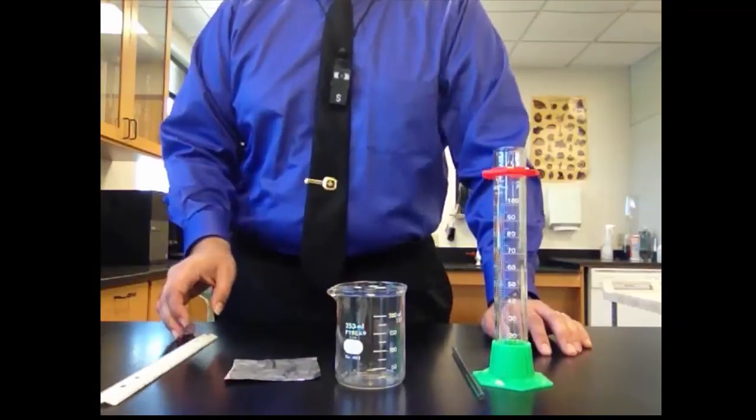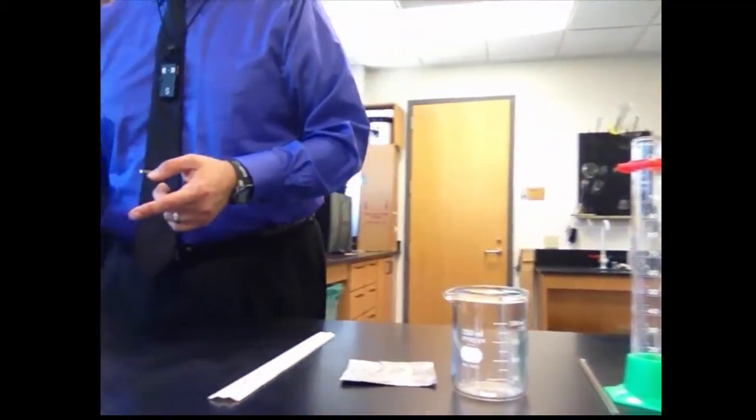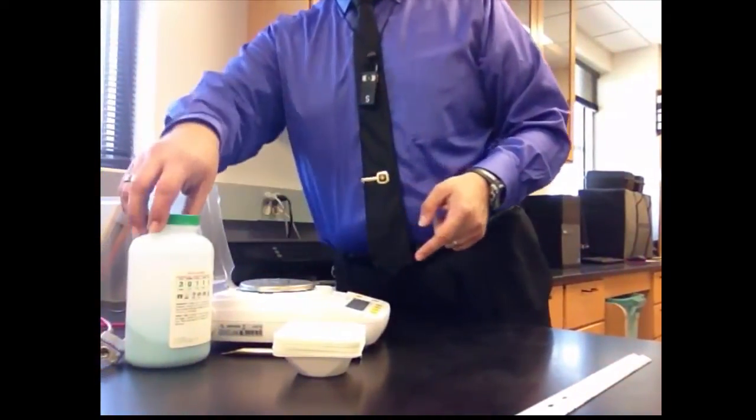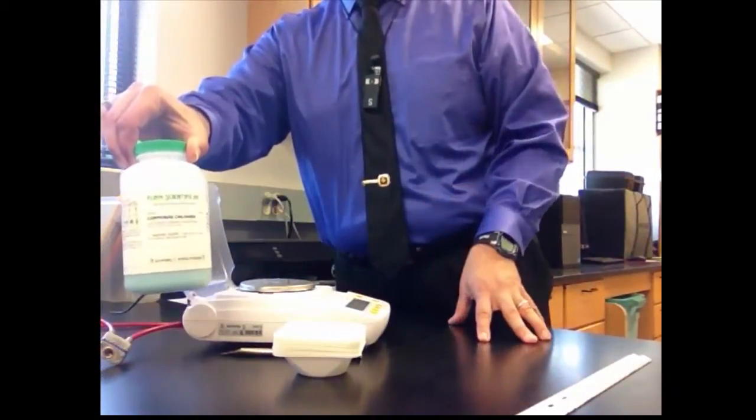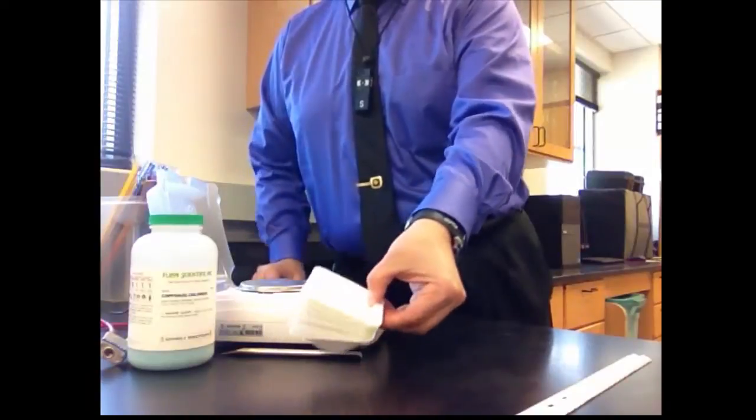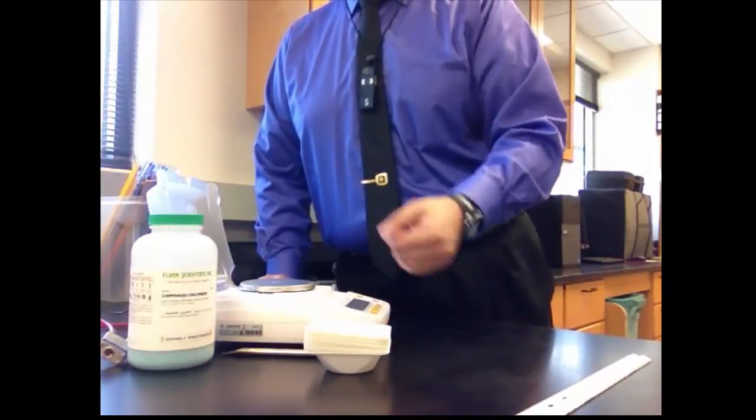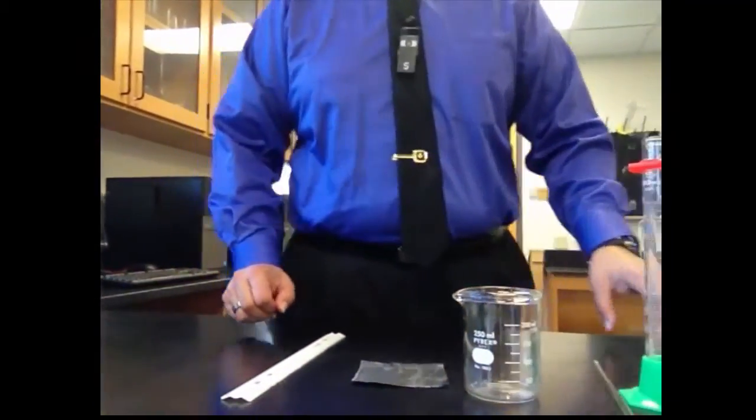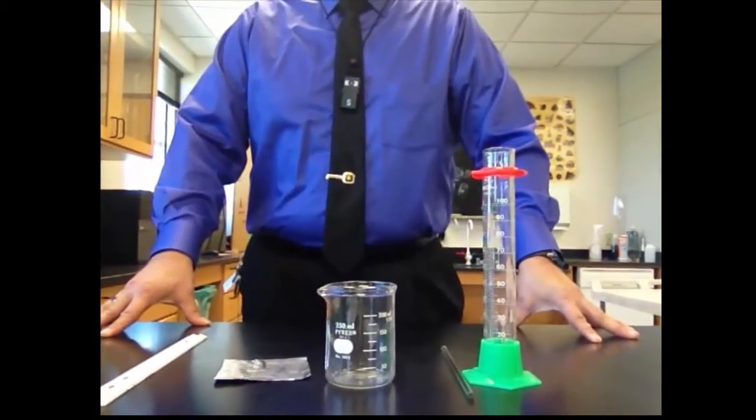And we have a centimeter ruler right here. And we have a couple of other things. Just over here, we have a balance. This is a digital balance that we'll be using. We have the substance called copper chloride and some weighing dishes to weigh out what we need. We're also going to need some deionized water. And you should know where to get that by now.